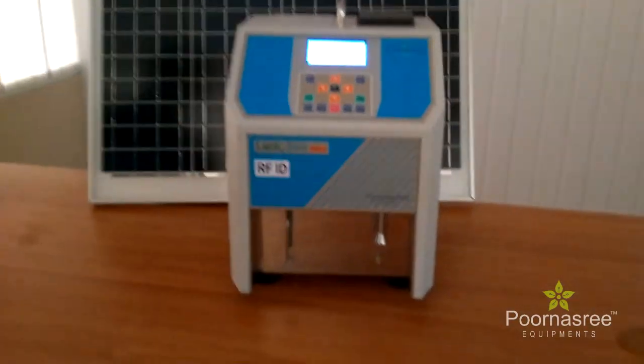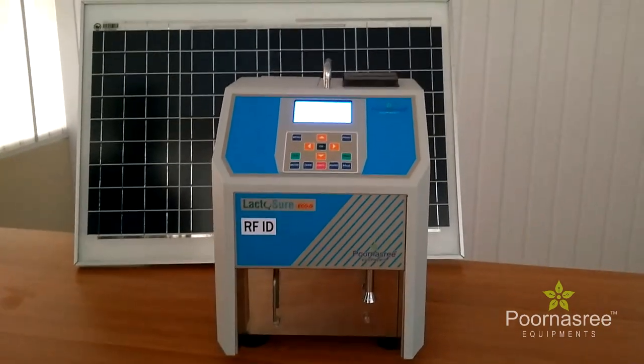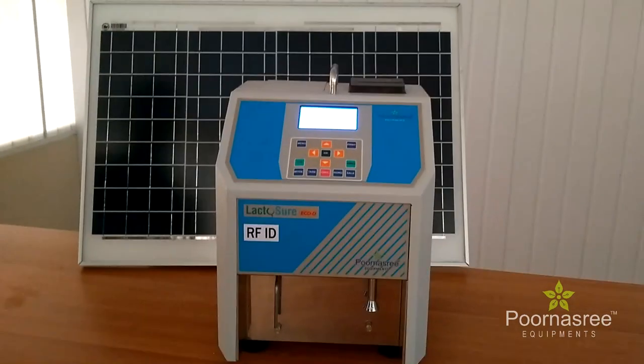Moreover, on mobile station — meaning on a vehicle — this equipment can also be used in the collection center.